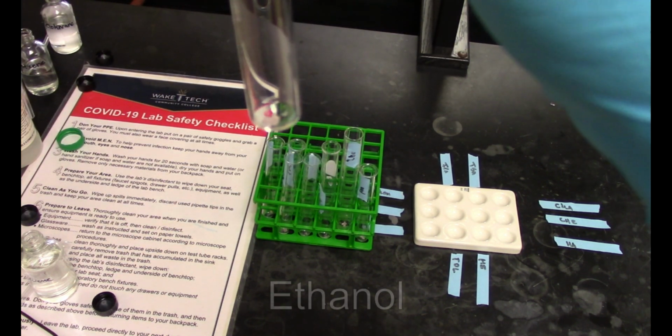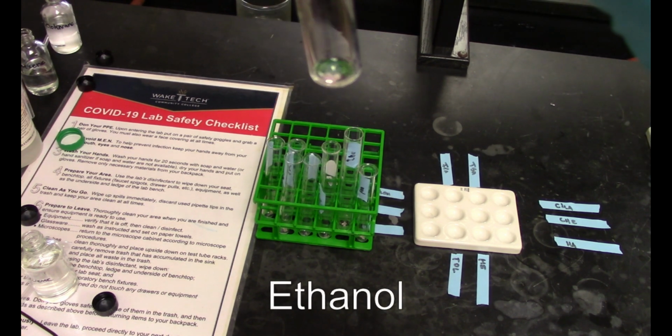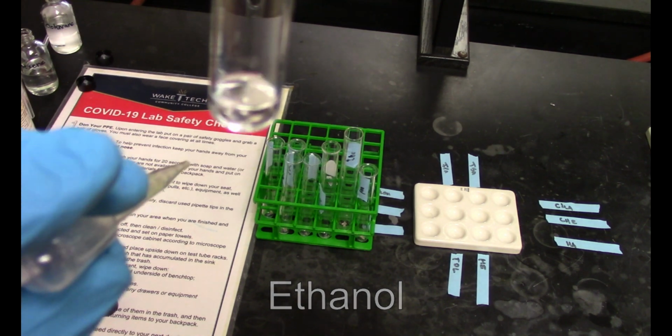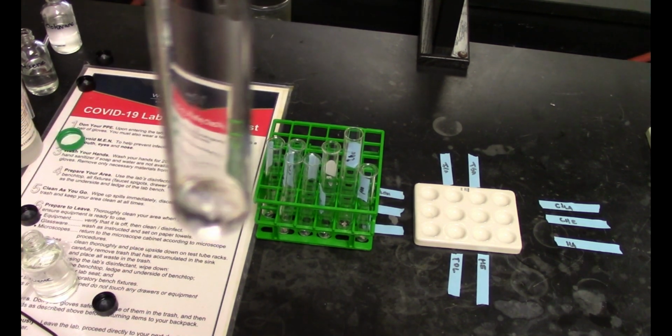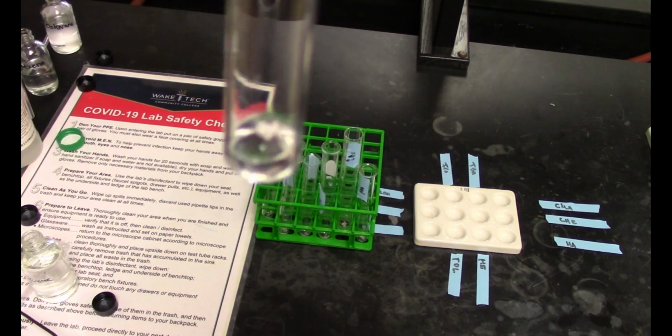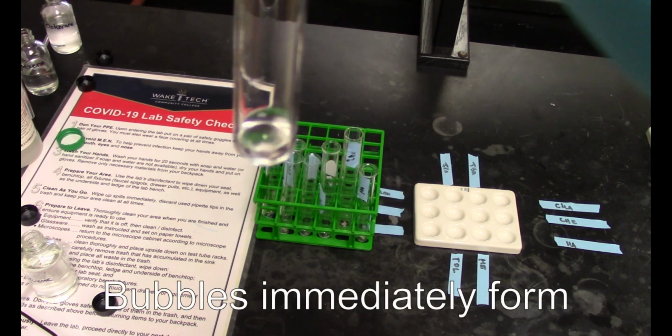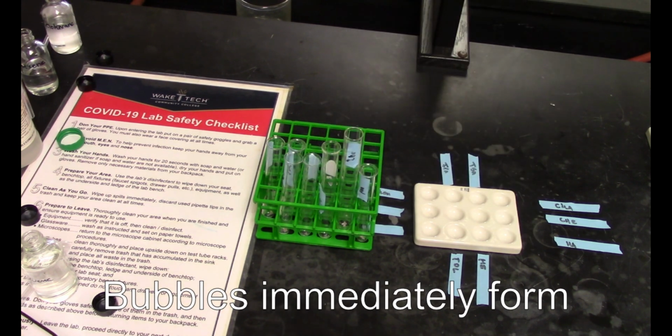So ethanol here is an alcohol. I'm going to add a few drops. And what we see off the bat when we add the ethanol is that we do begin to see a lot of this kind of foaming around it. Now it's going to take just a minute for some of the reaction to take place if it is going to occur, just because we have to wash the mineral oil off the sodium. But we definitely see it kind of like floating around. So there is a reaction with ethanol.